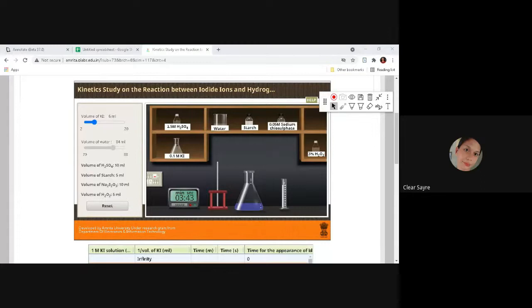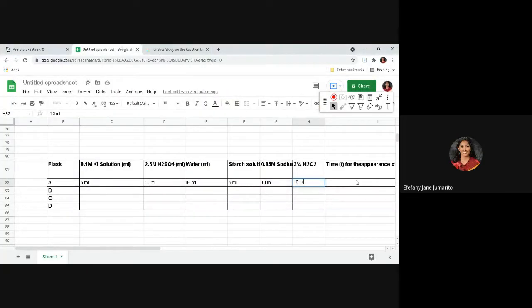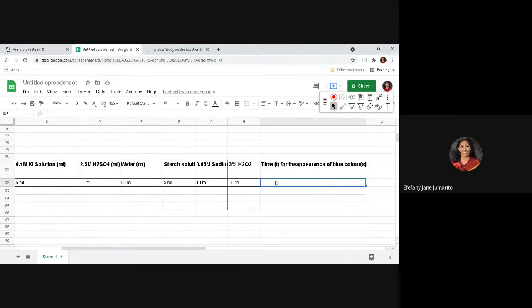So now, let's take note of the time: 3 minutes and 43 seconds. Excuse me, ma'am, isn't it 5 ml of hydrogen peroxide?